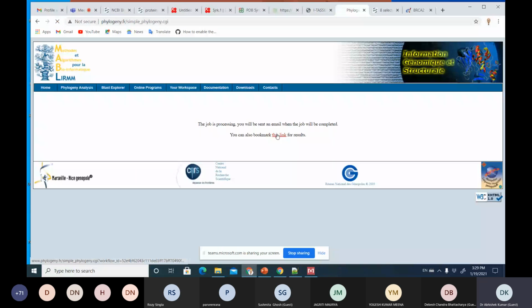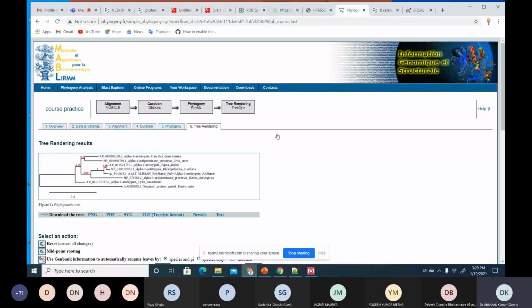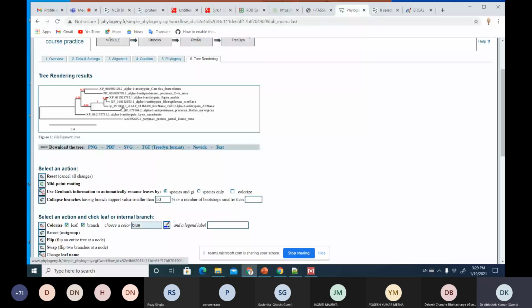So this is bookmark the website, so it's still running. So you see that the server, yeah. So this has already run. In this one, it is giving you an idea, yeah. So if I can zoom, or maybe I just open as a PDF, we get an.